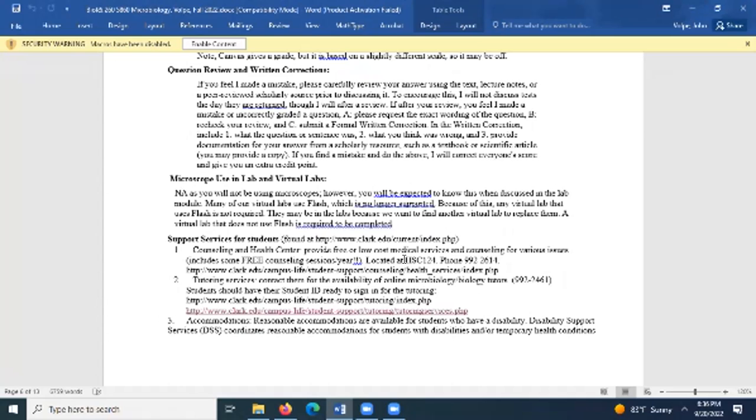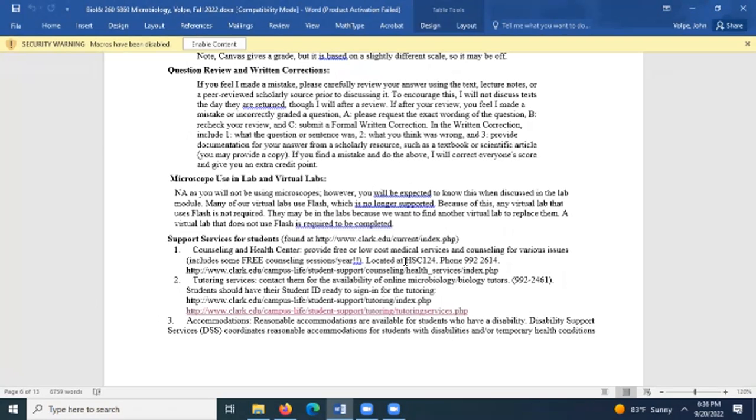So we only have, I think, 2 virtual labs where you will be doing the lab work using your computer. Like with the microscope, you will actually be adjusting the microscope or working on a virtual microscope on your computer where you can adjust the microscope, look at a slide, adjust its viewing.